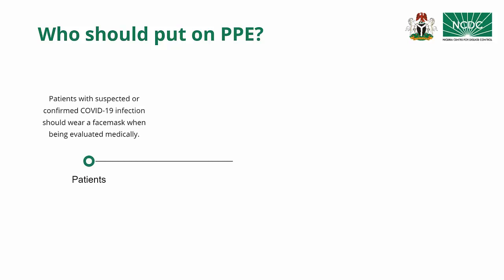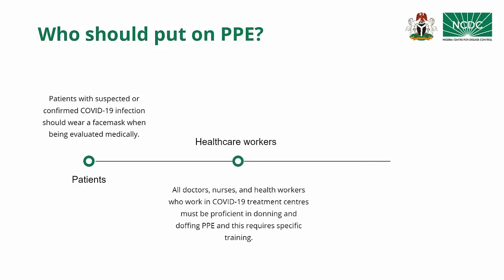Patients with suspected or confirmed COVID-19 infection should wear a face mask when being evaluated medically. Healthcare workers, doctors, nurses, and health workers who work in COVID-19 treatment centers must be proficient in donning and doffing PPE, and this requires specific training.